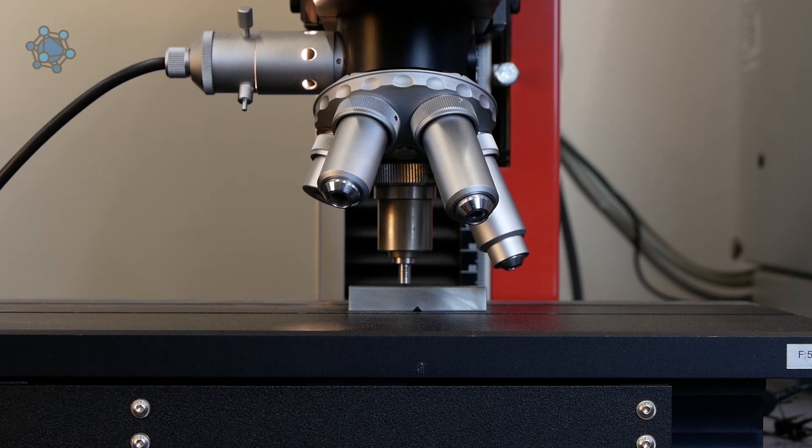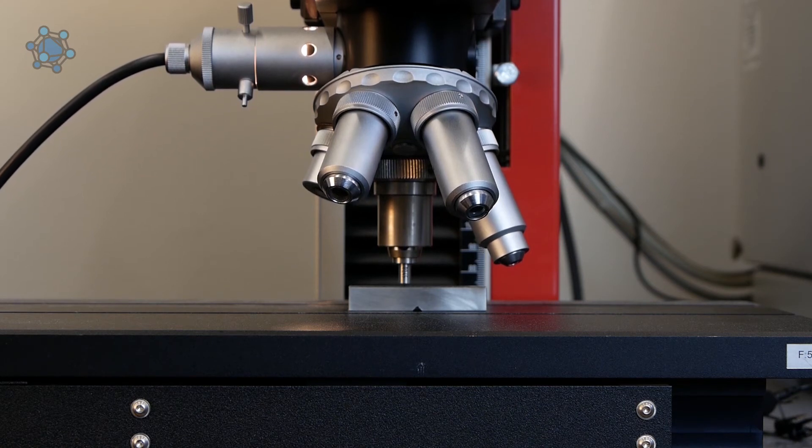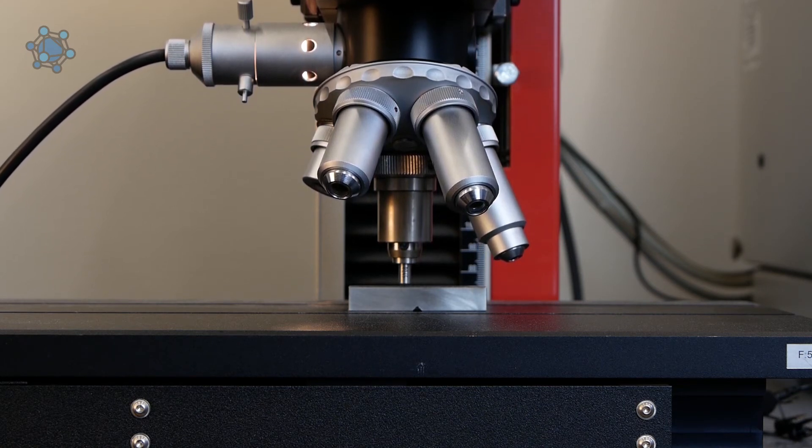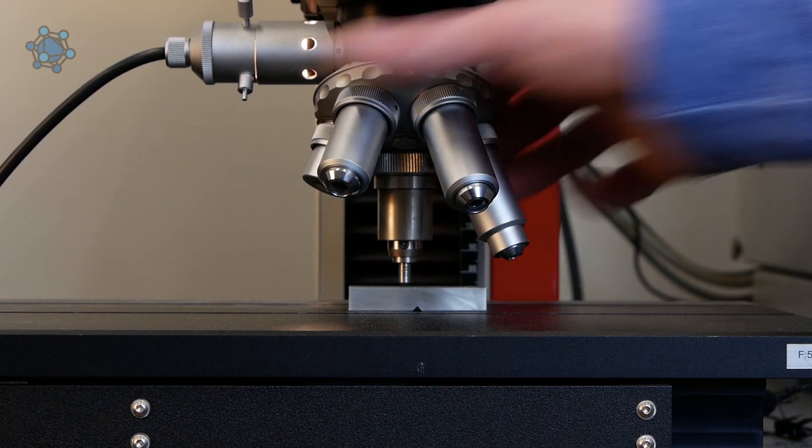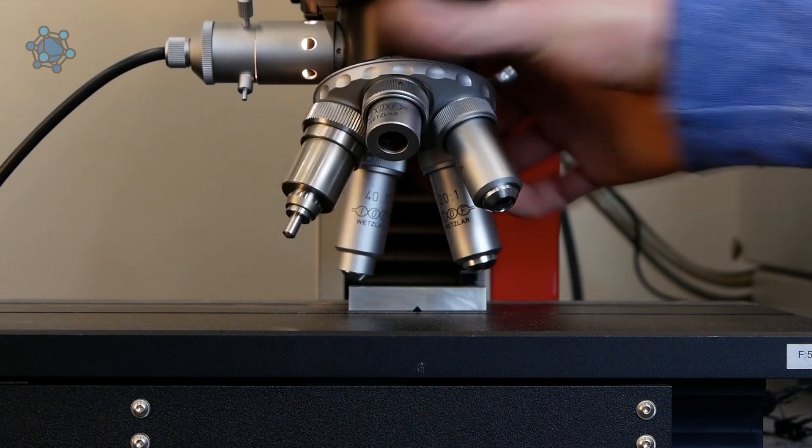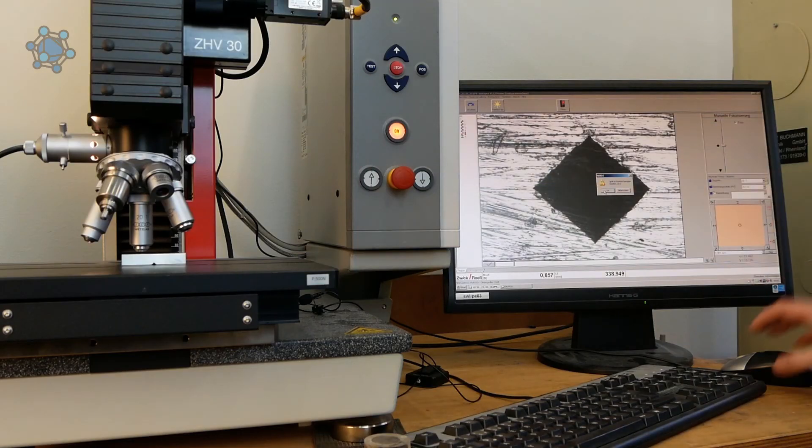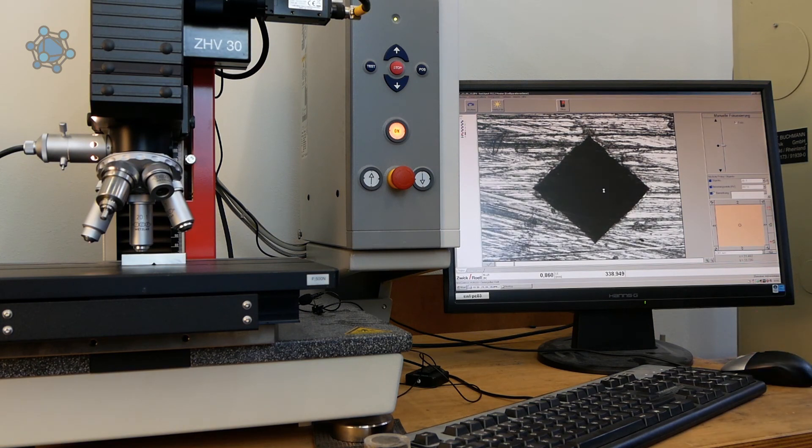After the holding time of 10 seconds, the test head moves up again and the specimen is unloaded. The indenter is then swiveled out of the way and the objective is swiveled forward so that the two indentation diameters can be measured on the screen.